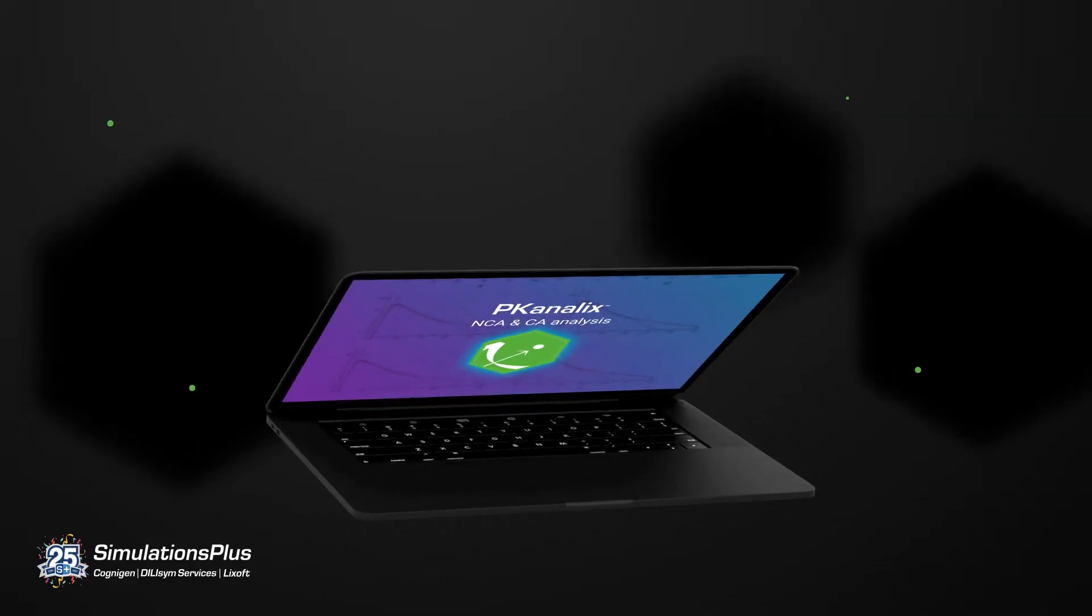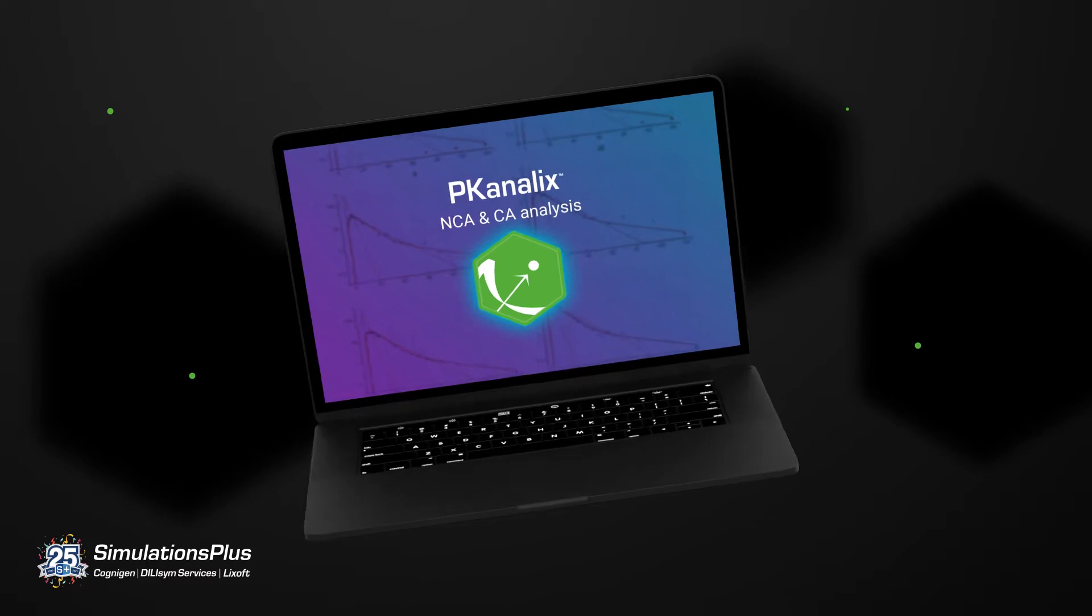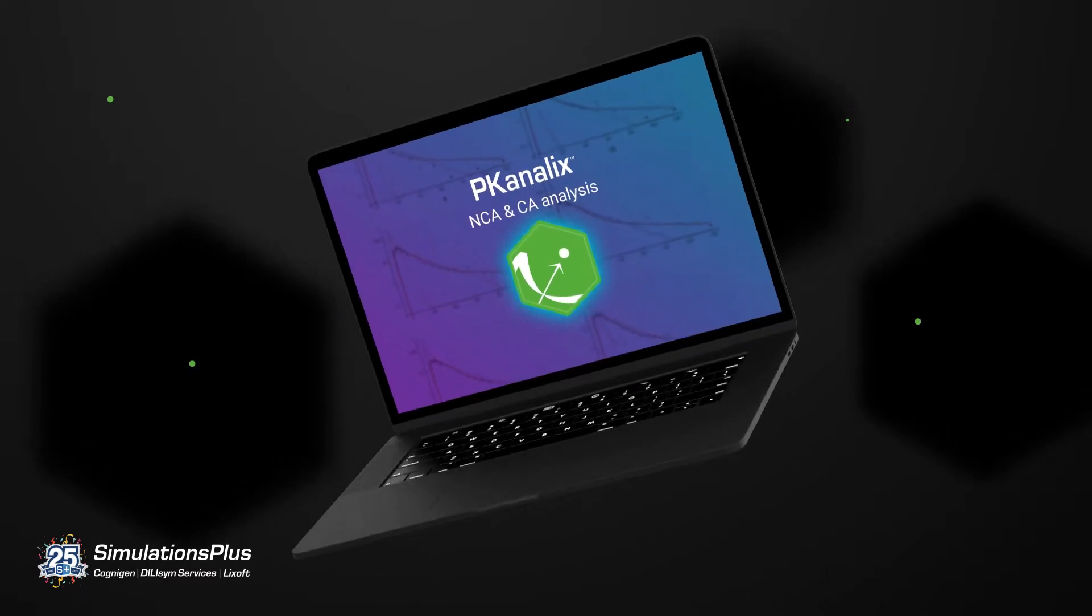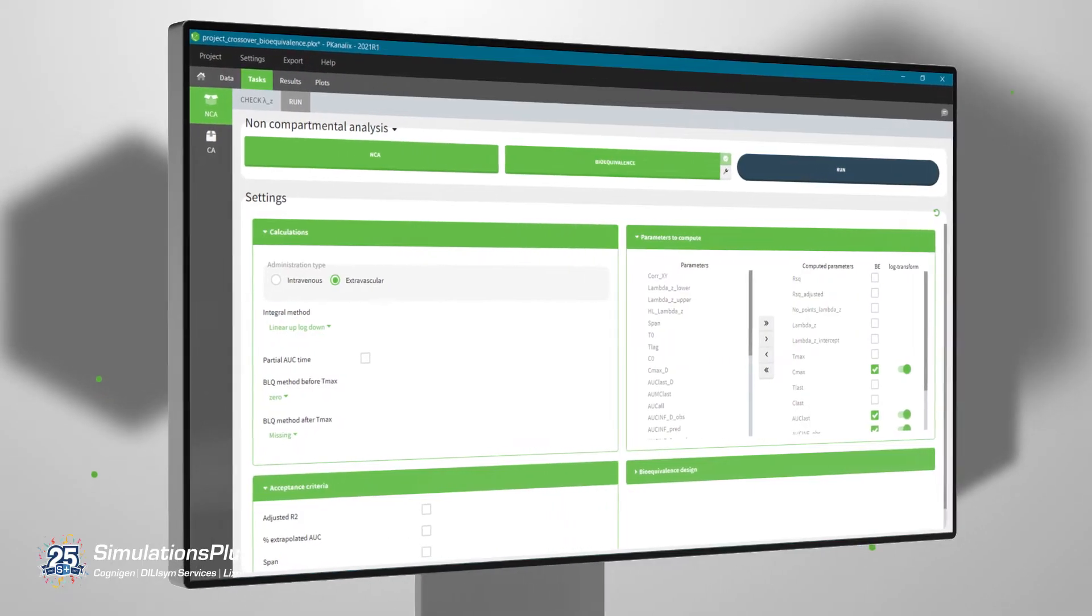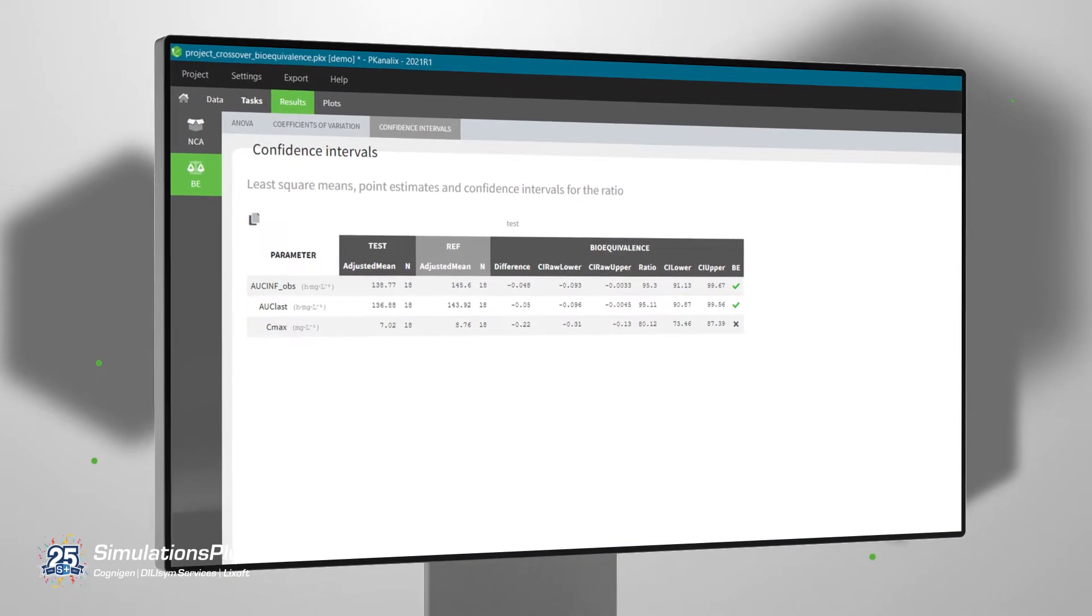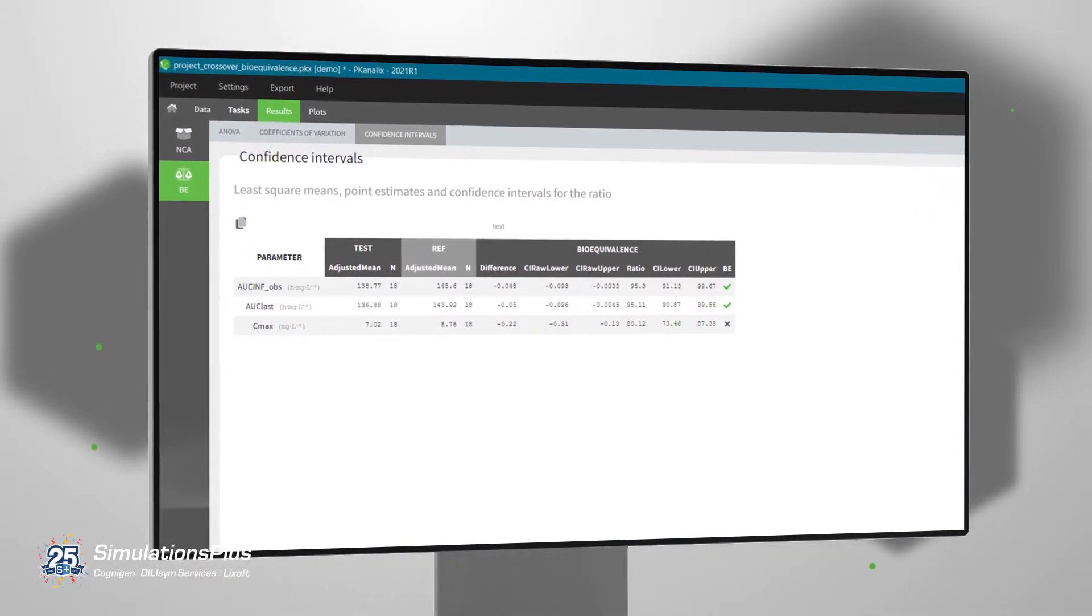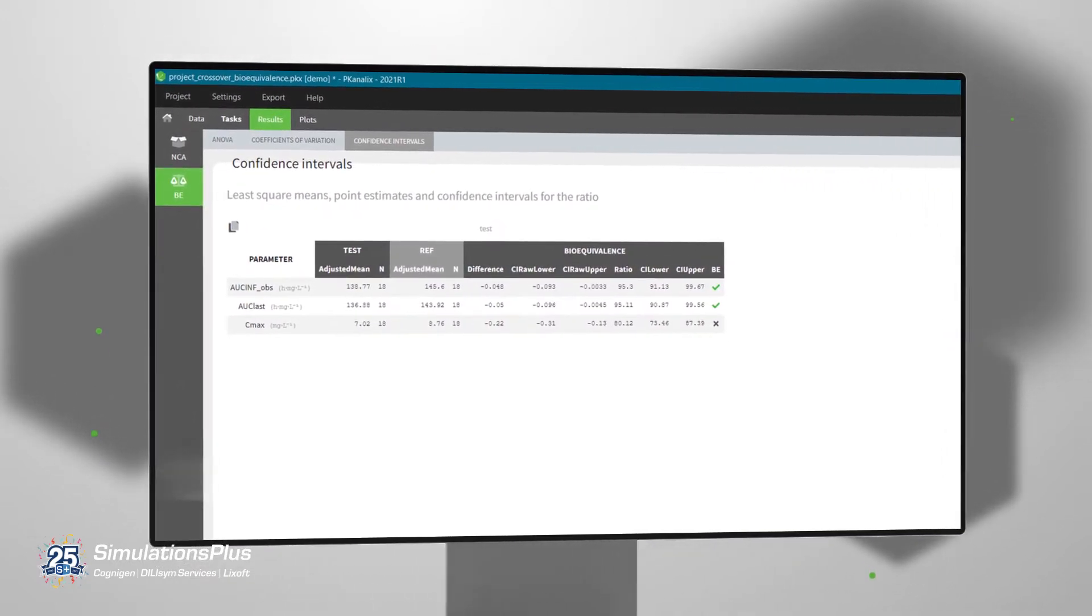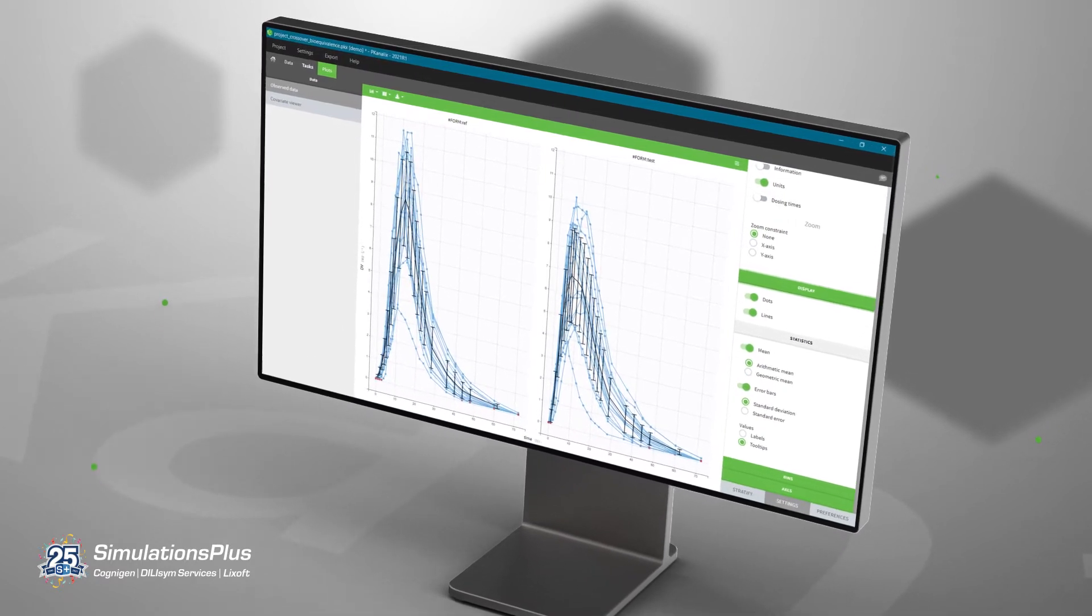PK-Analyx is graphical and interactive software for non-compartmental and compartmental analysis. Run analyses in just a few clicks. Results are displayed in intuitive tables and interactive plots give you immediate data for analysis.